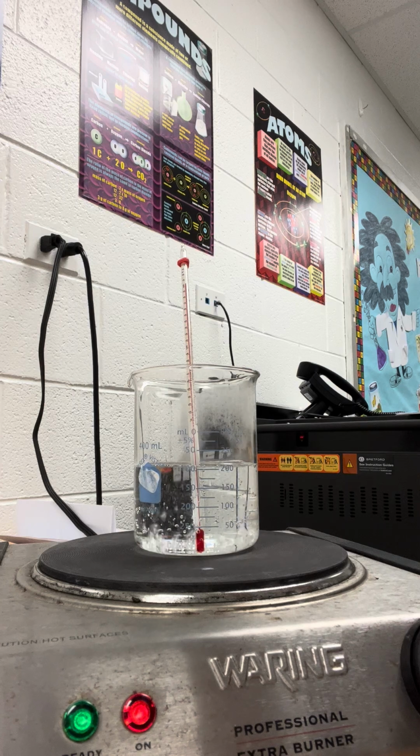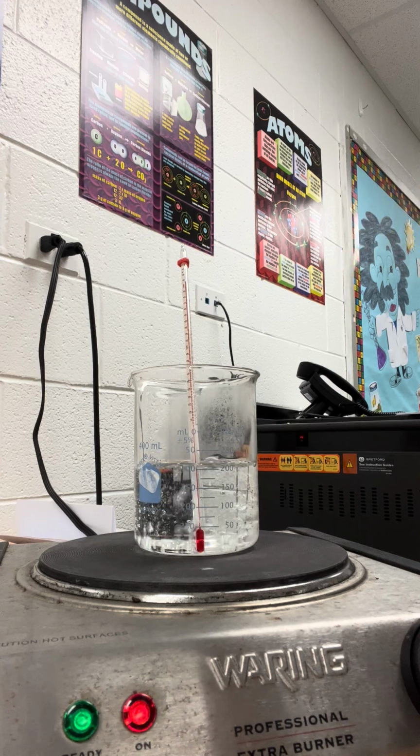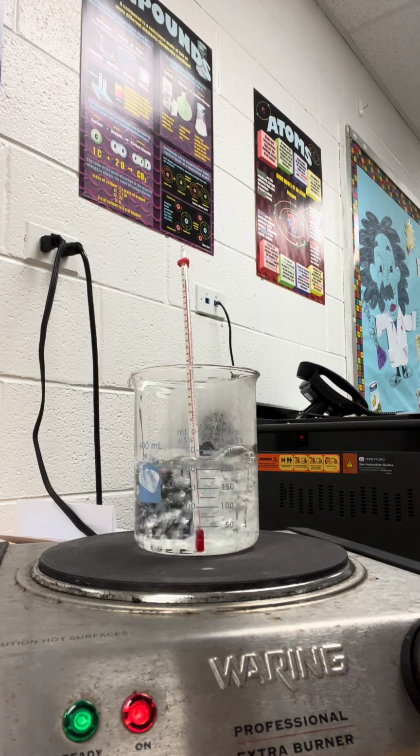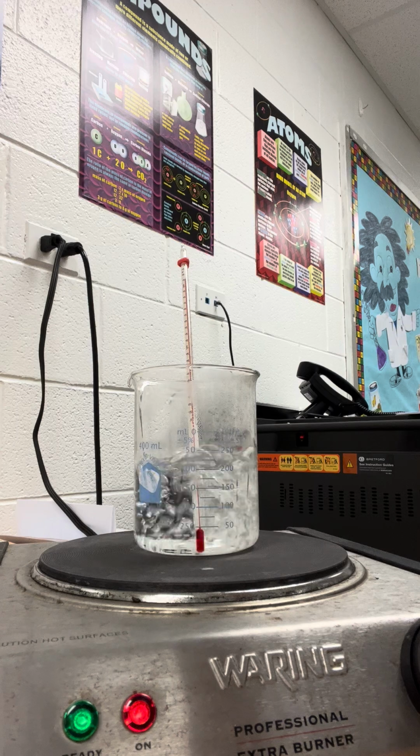And once they're sped up enough, the water molecules are then going to be transformed into a gas state, which is what we're starting to see now. So we are approaching 100 degrees Celsius, which is the boiling point of water. And as you guys can see now, it might be hard to see in the video, but there is steam or water vapor coming out of the beaker, and we have reached a full boil.